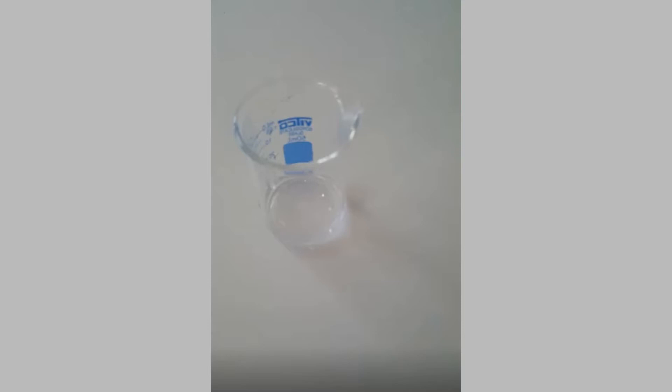What is your answer? We will be using litmus paper. I am going to perform an experiment by using litmus paper. Shall we start the experiment?